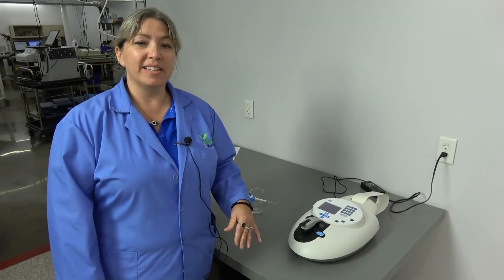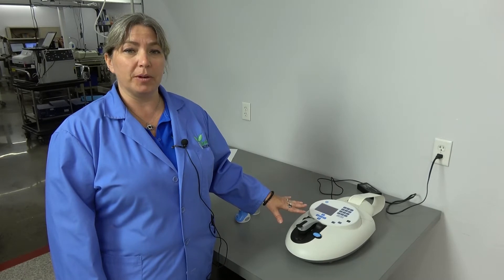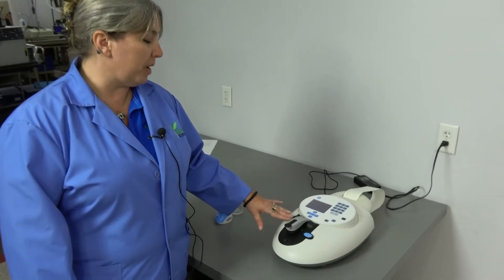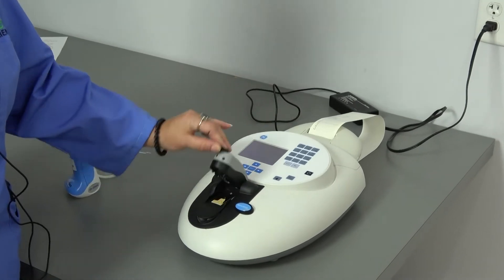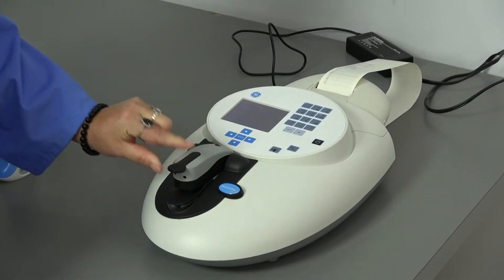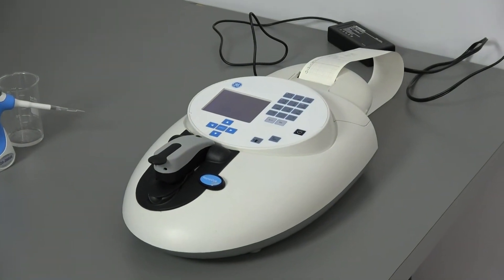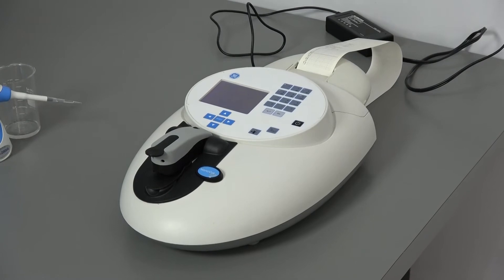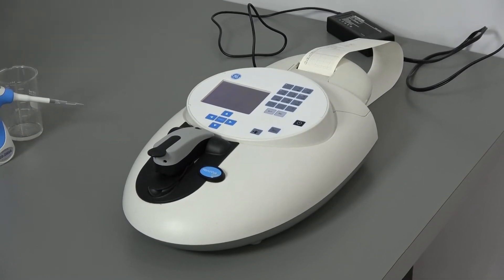Hi, I'm Lori and we're at New Life Scientific taking a look at the NanoView Plus spectrophotometer. This is a UV-VIS spectrophotometer made by GE. It uses extremely small quantities of sample, and would be used for quick and accurate quantitation of nucleic acid, protein samples, and those types of things.